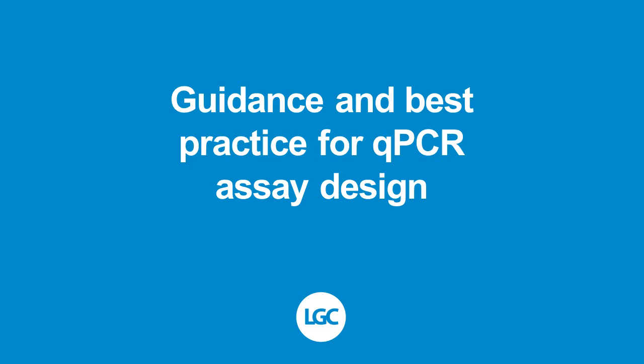The following section provides example guidance, recommendations and best practice for the design of quantitative PCR assays.